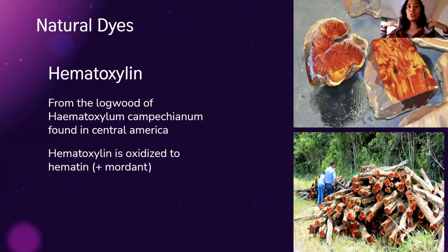So for Hematoxylin, guys, it's from Central America. Ang raming punong pinuputol, or they really have a production for this. Ang galing, no, guys, galing sa puno yung hematoxylin. So galing siya sa Hematoxylum campechianum, yung logwood.